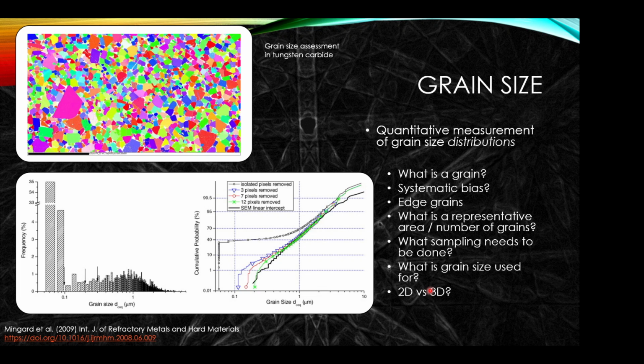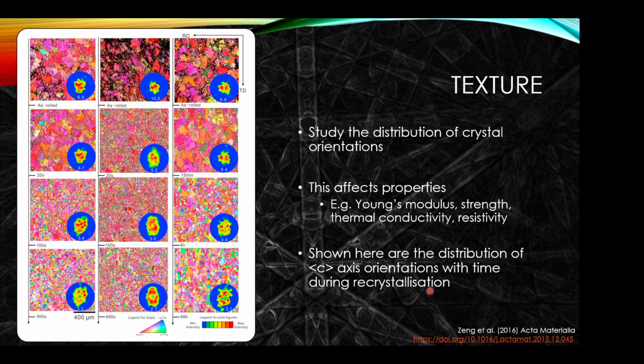But we can start to see the potency of the EBSD technique in this evaluation. We can measure the average grain orientations and we can track how that evolves. In this example, we're looking at, I think it was, in situ annealing to enable recrystallization of a magnesium sample.